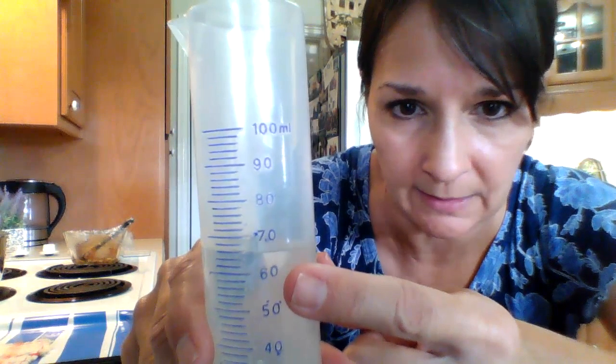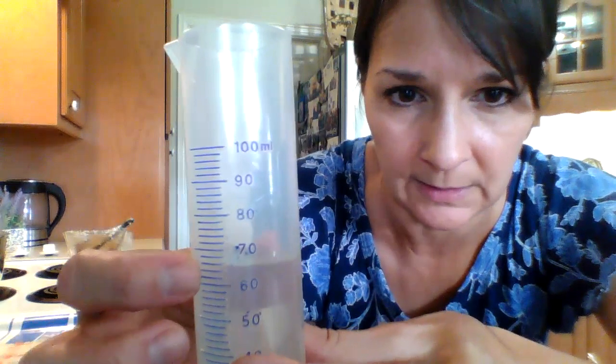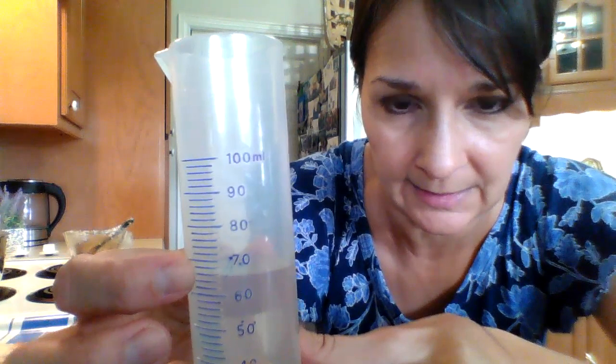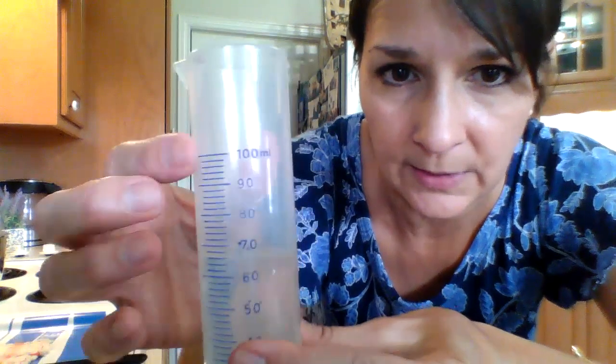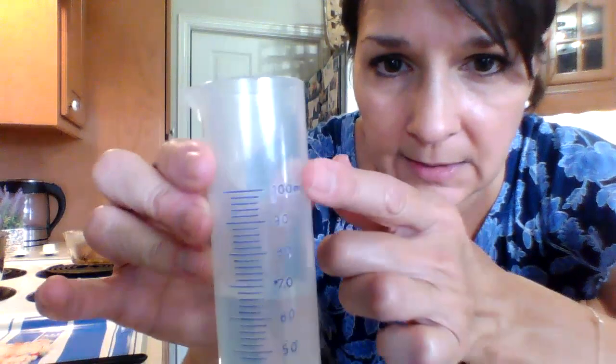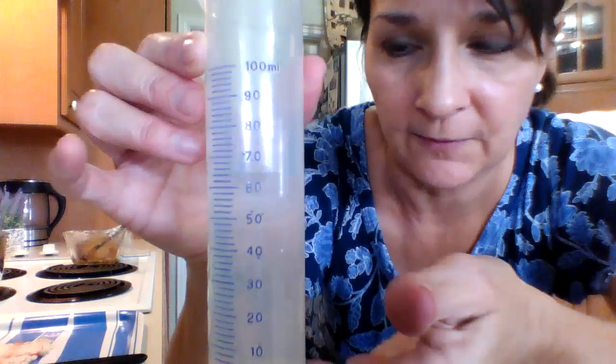And we determined that in this graduated cylinder, we're counting by twos. So if this is 60, then 62, 64, 66 is right there where the top of that water is. Okay, and notice that it's 66 milliliters. So the volume of my liquid here, which is water, is 66 milliliters. And that is how you measure liquids with a graduated cylinder.